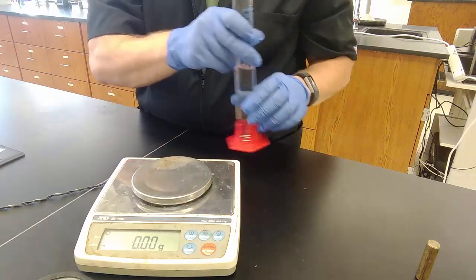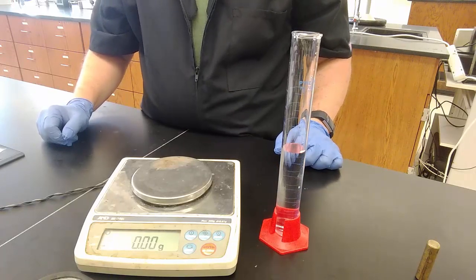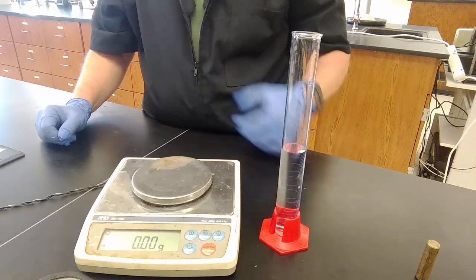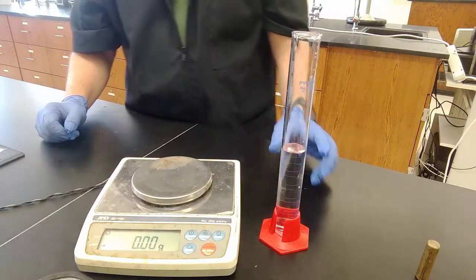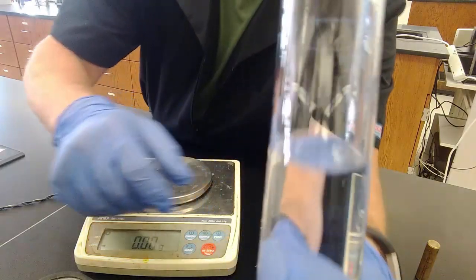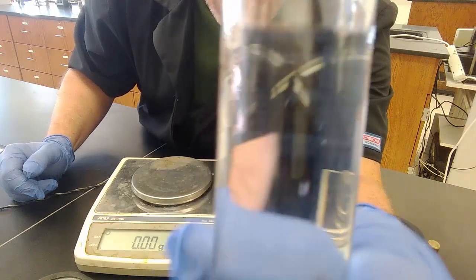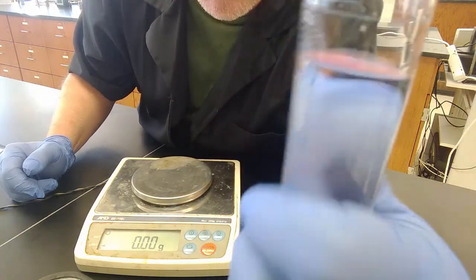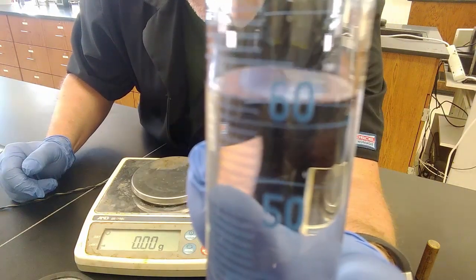Did it say any sort of special deionized water? No. Just water. Did it say exactly 50 milliliters? No. It said about 50 milliliters. So I need to measure the exact volume. So if you look here at the meniscus, I'm going to look at this here, it's a little bit above 60, okay?